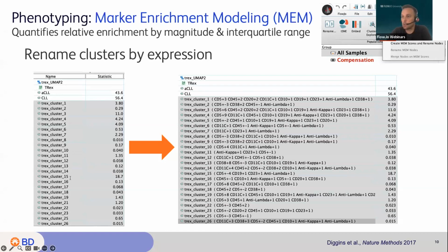After merging a cluster, can you use Cluster Explorer to merge the clusters? In Cluster Explorer, you cannot merge a cluster. You can visualize the different clusters, but yes, you can look at them.